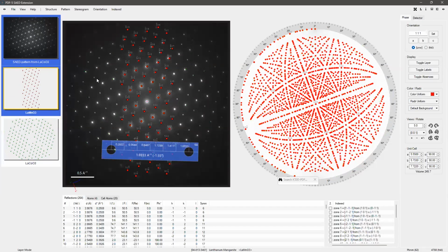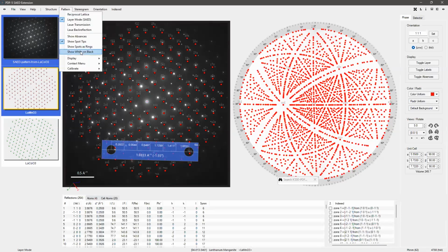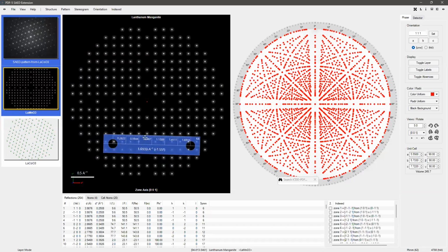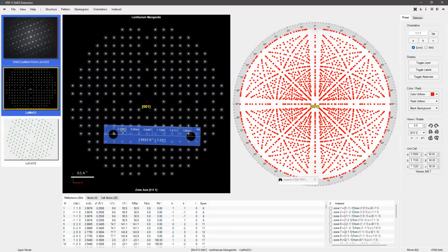One thing I want to point out, when we have a certain orientation here, let's just show this as like so, without labels. Oh yeah, because this is a rotatable image still, right? So now sometimes accidentally with the mouse interaction, you might rotate it slightly, even though you didn't want to, right?